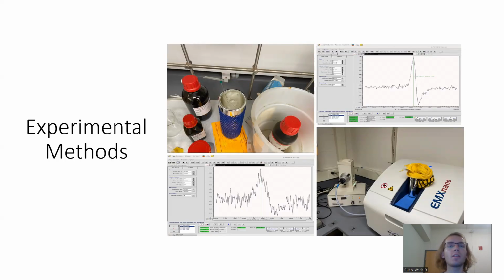The experiment was done by creating two solutions, one containing about 0.1 gram of deuterated naphthalene and the other containing about 0.1 gram of naphthalene, both dissolved in 2-methyltetrahydrofuran. These solutions were pipetted into EPR2, which you see has the green tip over here, then placed into the Dewar finger, which is this thing that has the towel over it, and liquid nitrogen was poured into it. A lock switch was done, and the arc lamp shutter was turned to let light through.